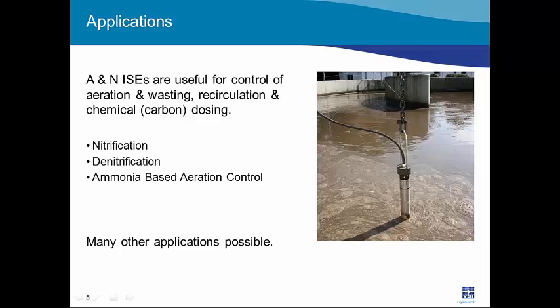There are a number of applications when we're talking about wastewater treatment, activated sludge in particular. The ammonium and nitrate ISEs are useful for control of aeration and wasting, and also recirculation and chemical, specifically carbon dosing. Really the 4 main control handles that a wastewater operator has.